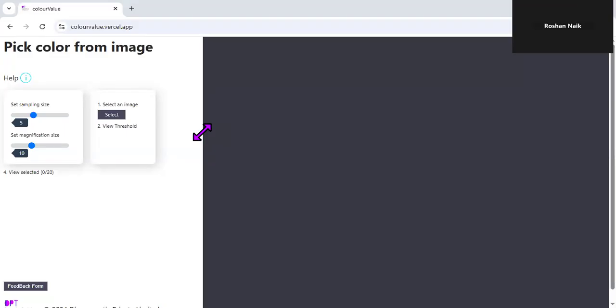Hello guys, today I will talk about how to analyze the data using the Color Value app. Sometimes it is not clear how to analyze visually. It is difficult to determine. So now I'll show you how to analyze using the app. It makes things very clear.